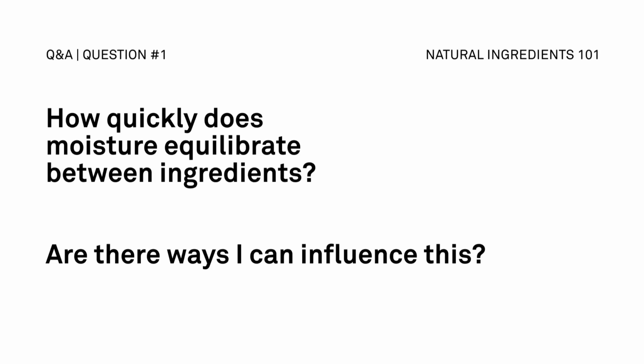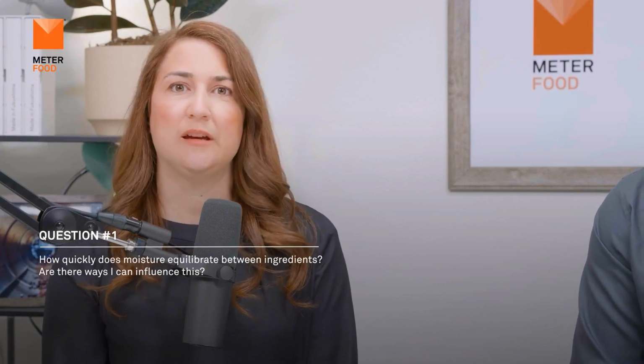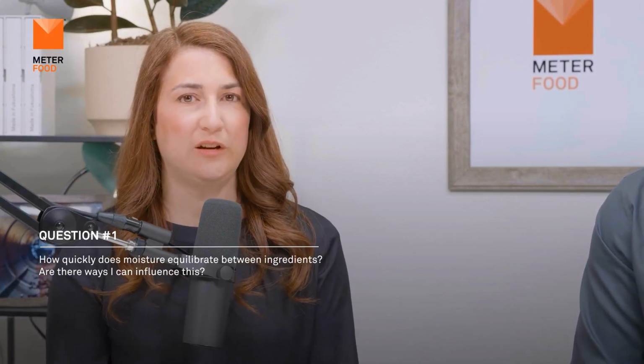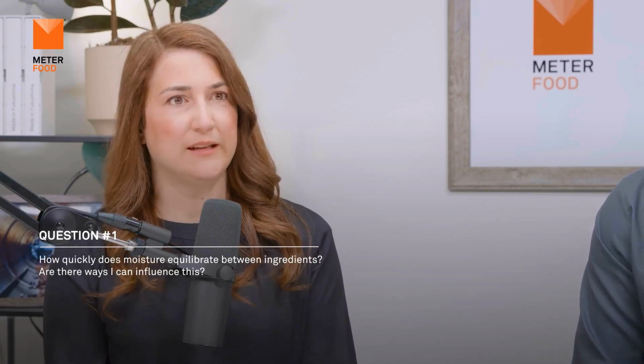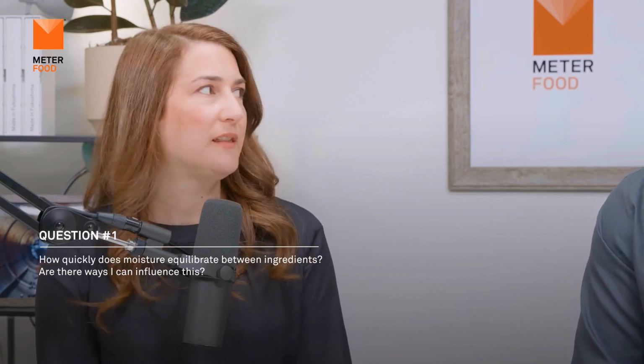I'll take that one. It can take a little bit of time. It depends on that relationship of how quickly something takes up moisture. When we did our examples of the blueberries and the almonds, it took about a week to put them at a different water activity and then let them be.